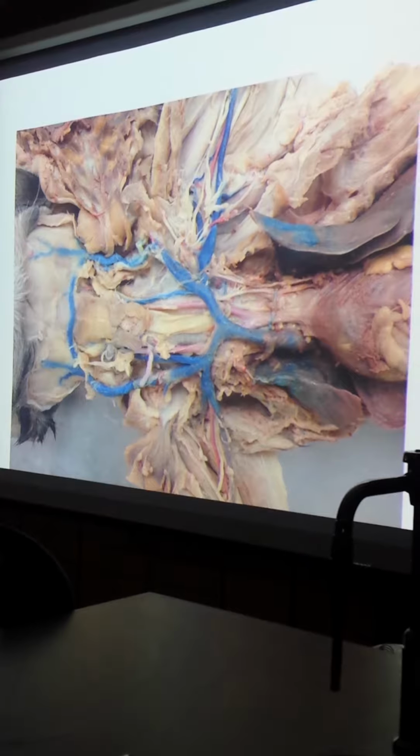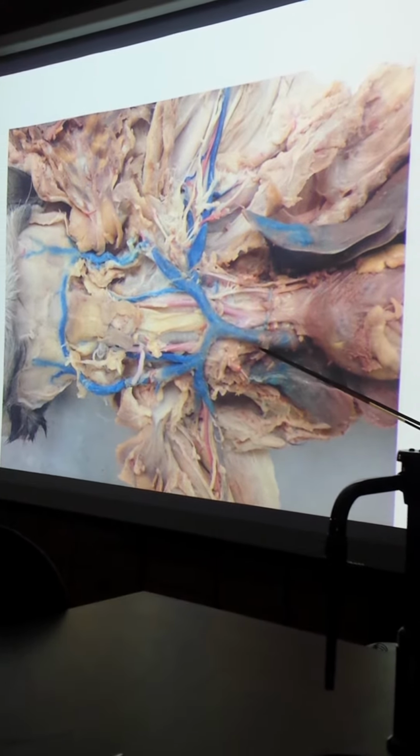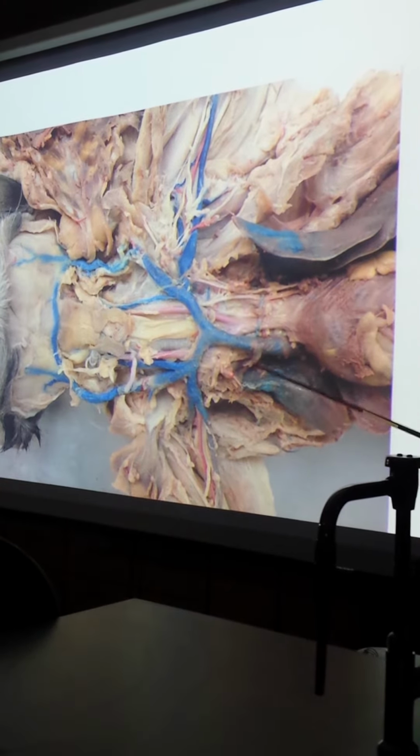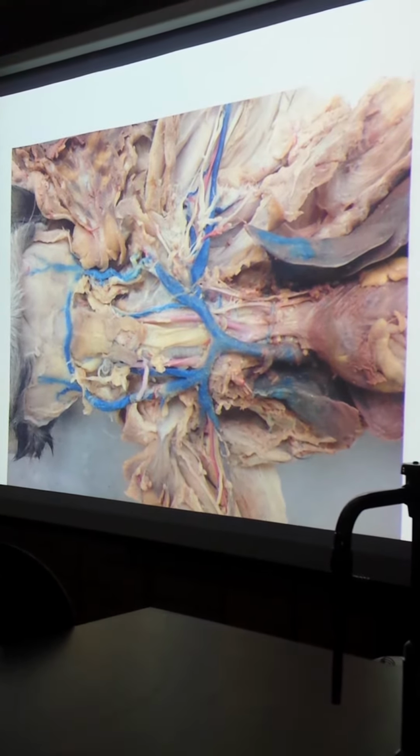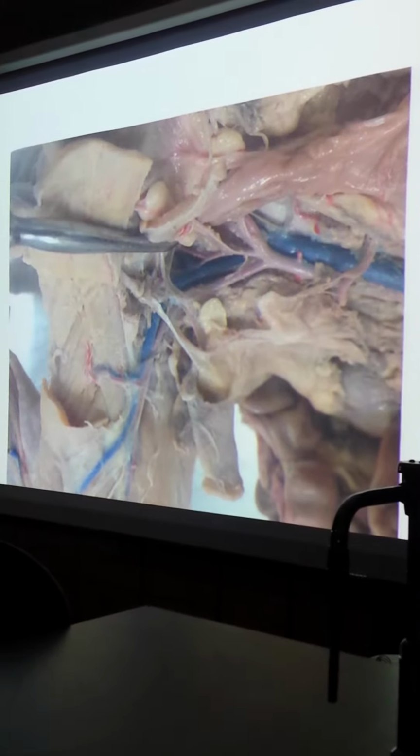And that's another one again. This part of the vein, internal mammary vein, didn't get infused nicely, but this one did. So this one is kind of looking off blue, but it is a vein. Alright, so we'll skip through that.